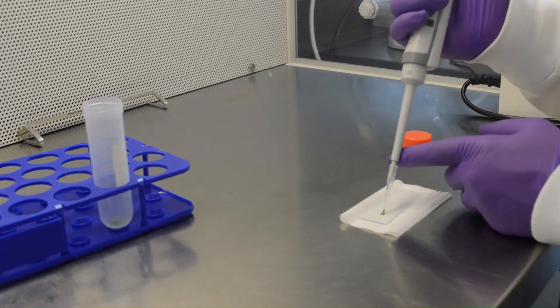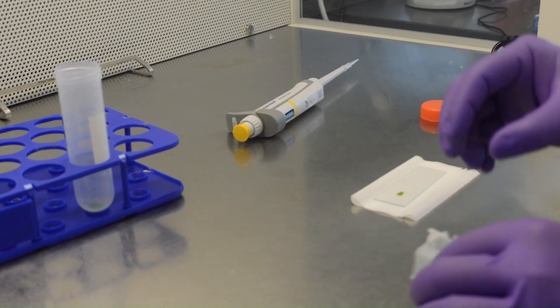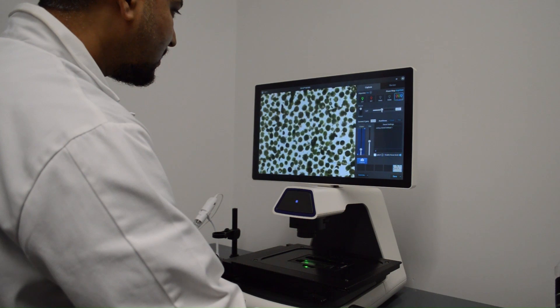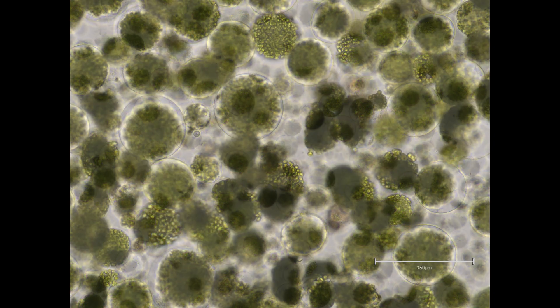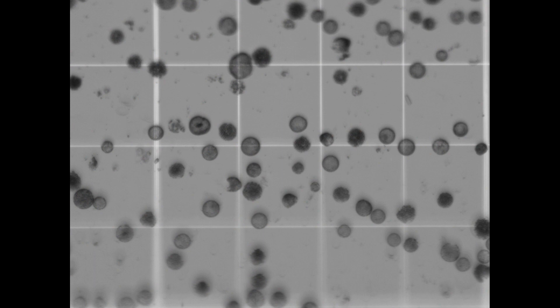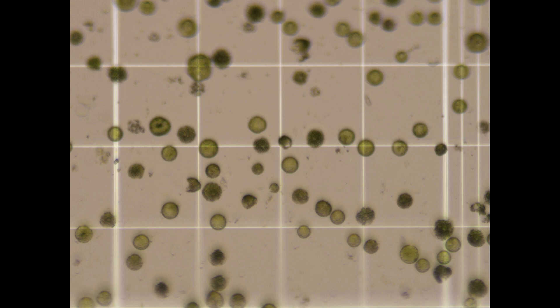Transfer 10 microliters onto a microscopic slide with a sterile wide bore tip and observe the cells in the microscope. Estimate the protoplast count using a hemocytometer and adjust the final density as required by diluting the cells with MMG buffer.